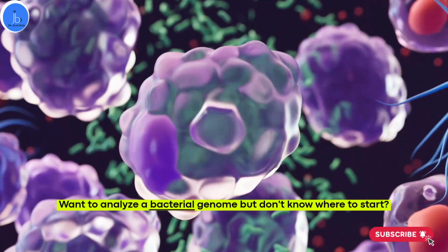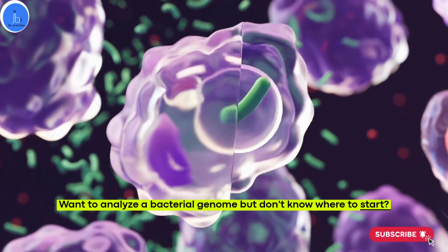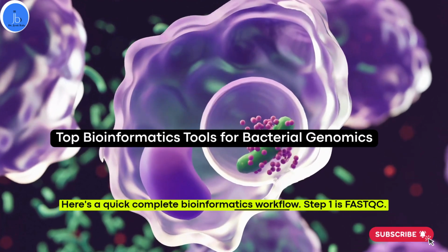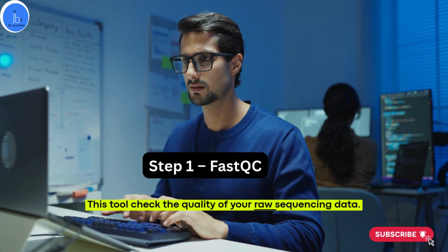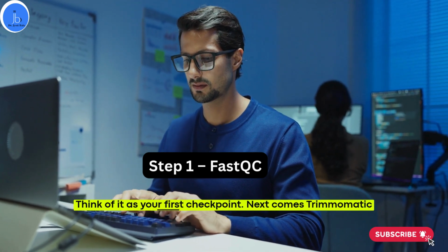Want to analyze a bacterial genome but don't know where to start? Here's a quick, complete bioinformatics workflow. Step 1 is FastQC. This tool checks the quality of your raw sequencing data. Think of it as your first checkpoint.